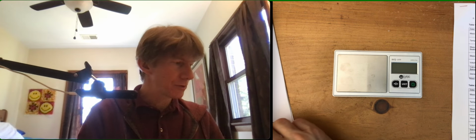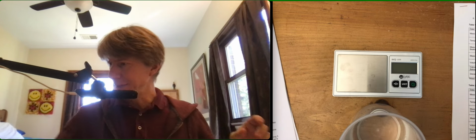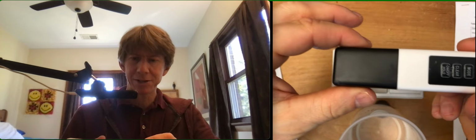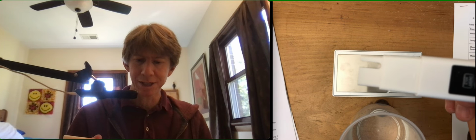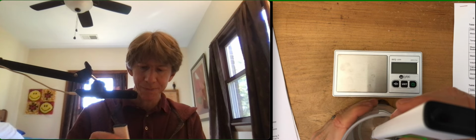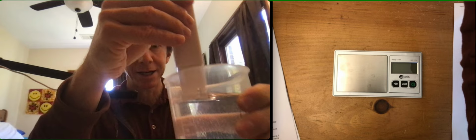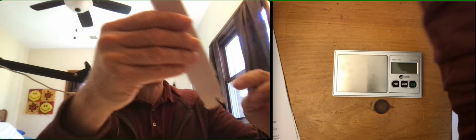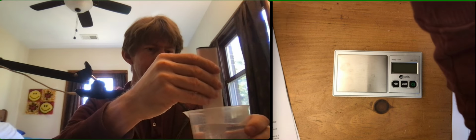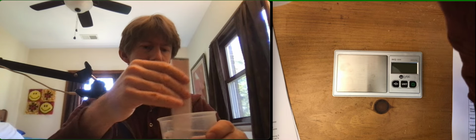Record the temperature of the 400 milliliters of water. Here's my water. I've got my temperature. I'm going to take this black piece off to reveal the actual temperature probe that's underneath there. And then I'm going to stick this into the water. When I stick it into the water, I'm only going to stick it in about right there. Actually, it can go into the full cap height.